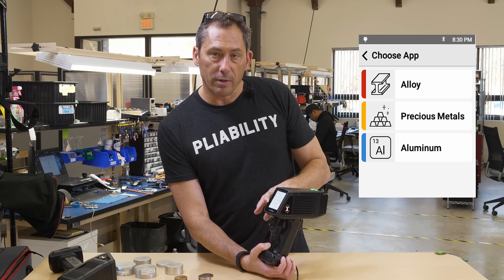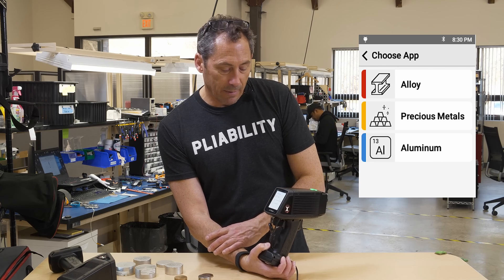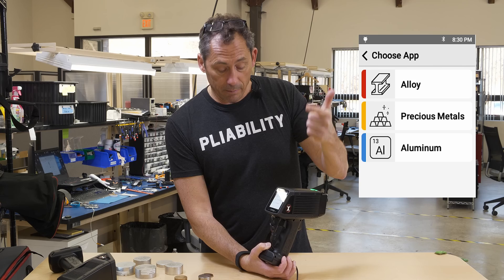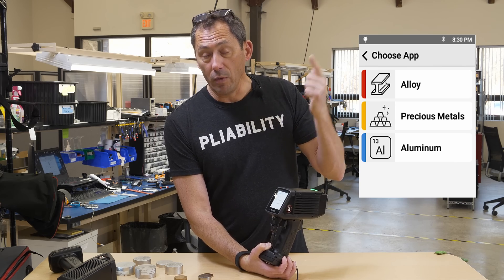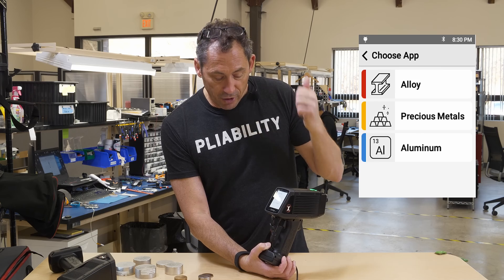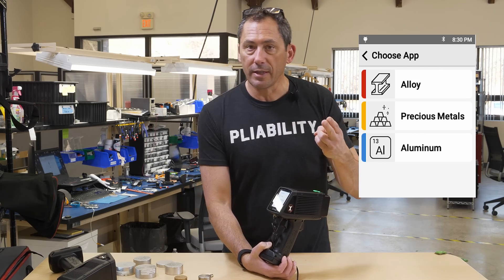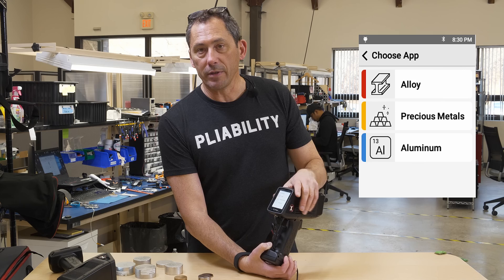That's coming soon as part of the instrument — the Car Cats app. So it's a complete scrap package: general alloys, high-speed aluminum — which has been a weakness of XRF until now — precious metals including gold, silver, and platinum, and then coming soon, Car Cats.